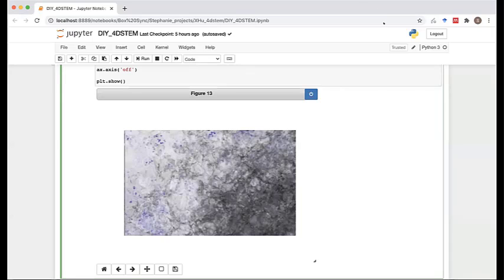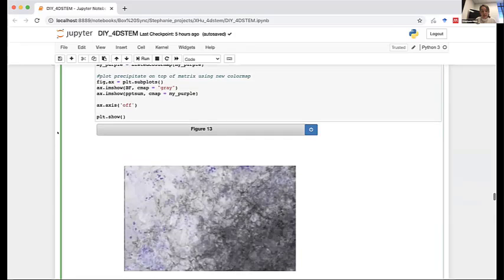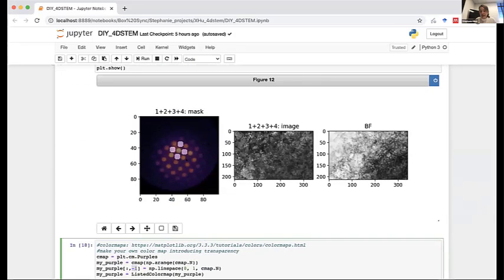And another thing here, if you want to comment on, is that in terms of speed, it depends on what kind of mathematical functions you are applying here. I think that answers the question, because in terms of speed and usage of memory, it depends on what functions you're using. Yeah, exactly. It depends on the function. A lot of the averaging steps take more time, but the masking and running through to integrate this is surprisingly quick.